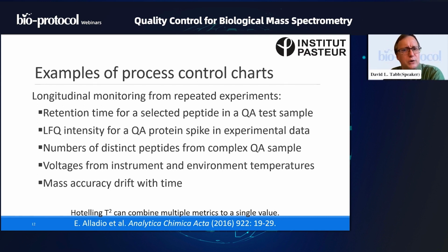How long does your institution own a mass spec? Do they use it for 2 years and then throw it away? No, because instruments are expensive. We don't do that. But if you have a $1 million instrument, you should hope, I think, that it is useful for 10 years. Okay, let us just say 10 years, but typically I think even orbitraps are not something that we expect to last much longer than that.